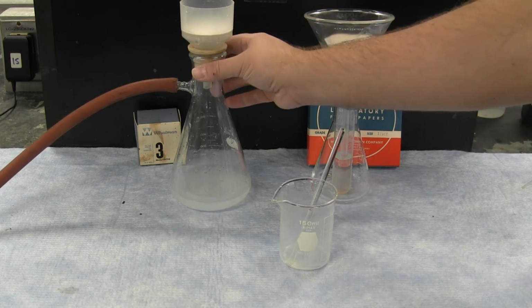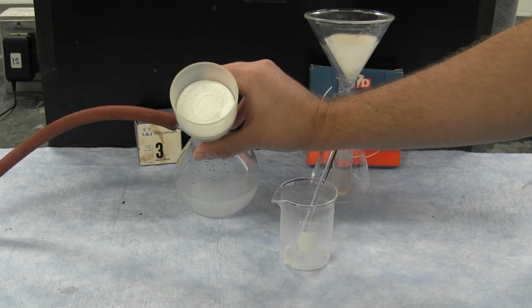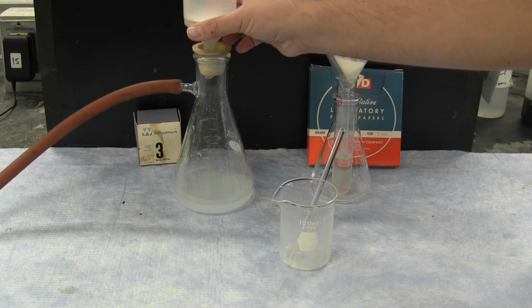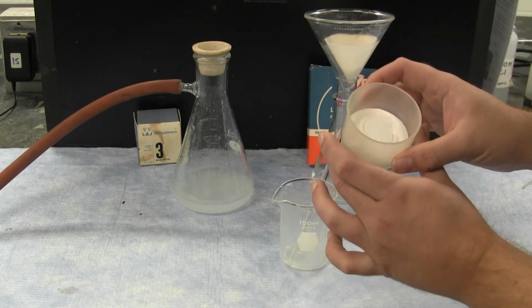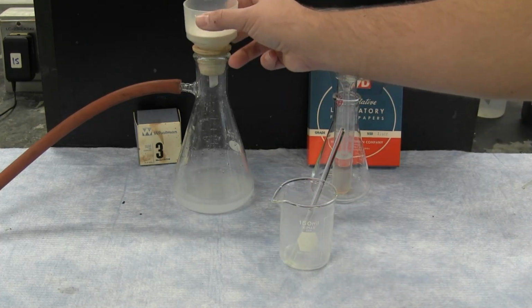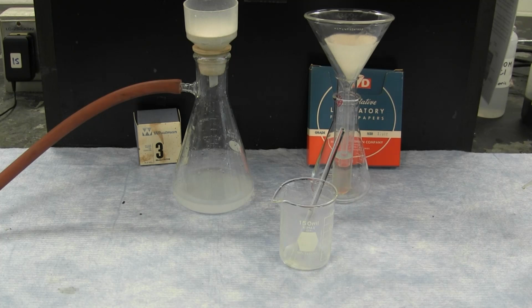After the filtration, all of the solid remains on the top, and you can turn off the vacuum system and take the filter paper out and analyze the solid product on top. Being able to filter and separate out the solid component from the liquid component is a very important lab technique that's useful both in general chemistry, organic chemistry, and in more advanced chemistry courses.